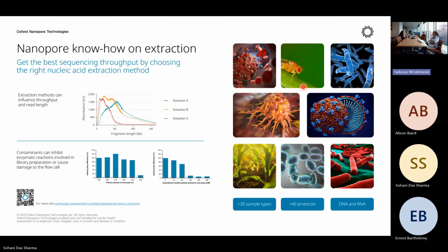We don't know whether those are gDNA or something else, because the fragment analysis we have done was not resolved properly on that TapeStation, and it's hard to know. But let's say those are all gDNA molecules.